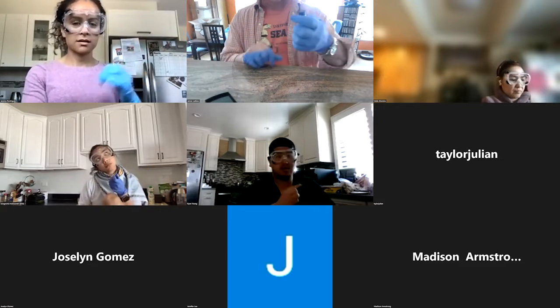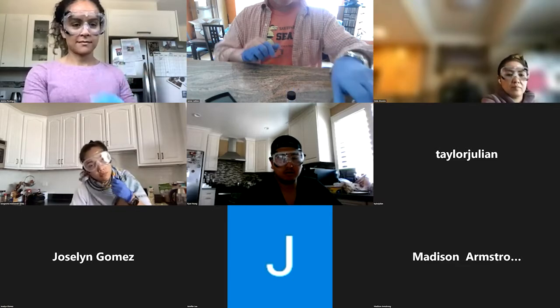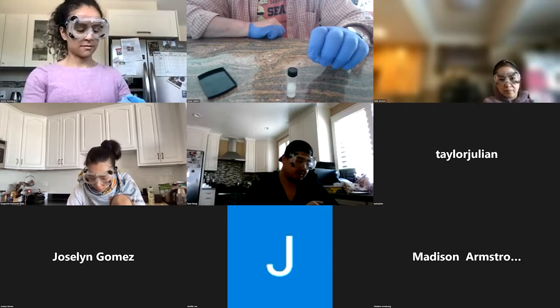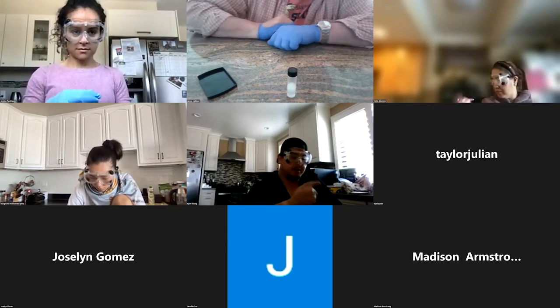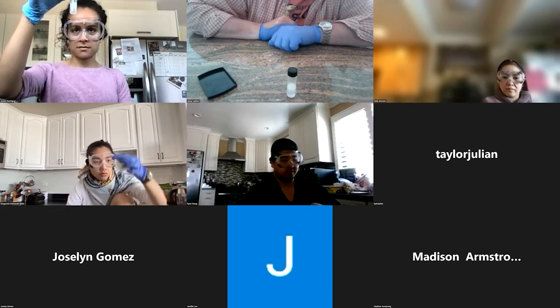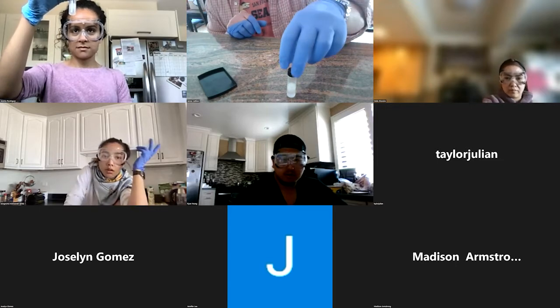So that means the heat's going into the reaction. So does that make it endothermic or exothermic? Endothermic. Endo, isn't it? That's right. It's an endothermic reaction. So we're just going to let that sit. You can see it's starting to separate already. So let that sit for about 10 minutes or so.